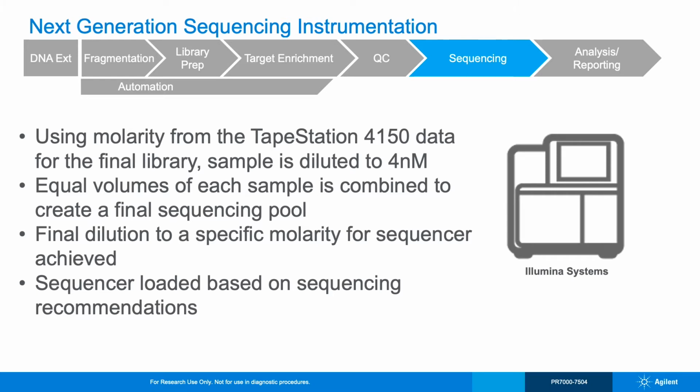The sequencer is set up based on sequencing recommendations and SOP. Now that our biopsy sample is sequenced, Casey will continue its journey through the informatics pipeline.